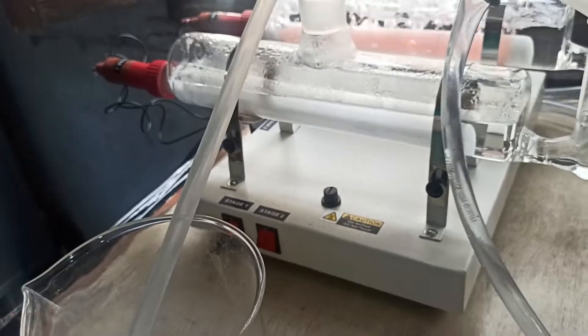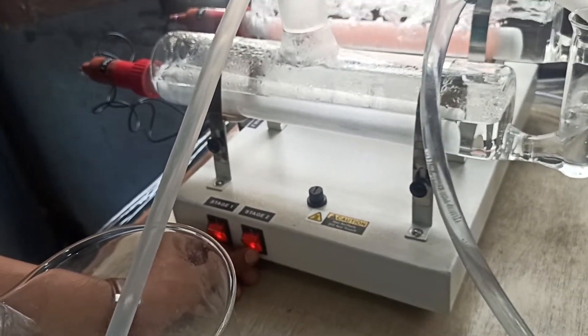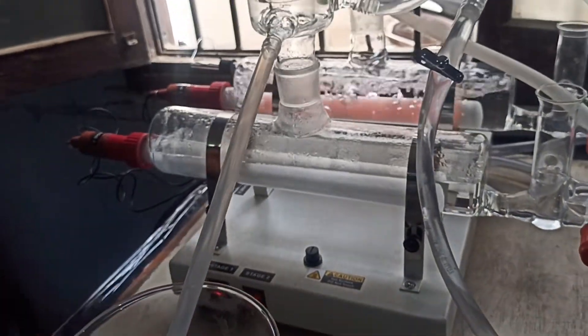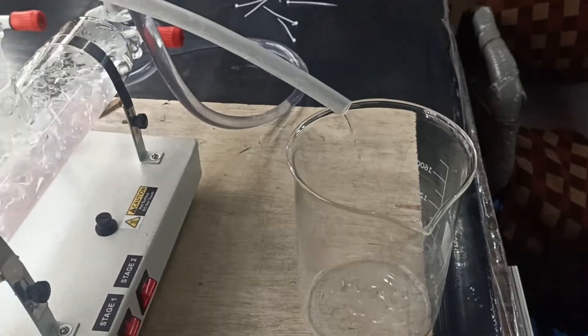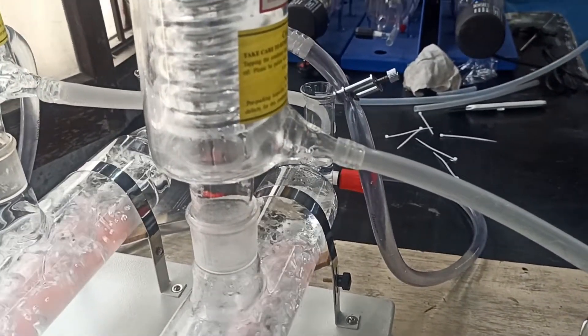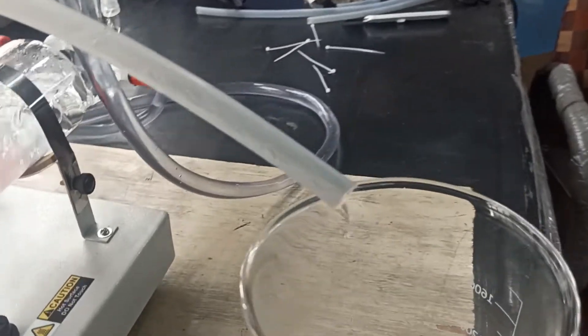Now, you can switch on the second stage power supply by pressing the stage 2 on-off switch. After some time, the double distilled water output starts coming from the second stage.